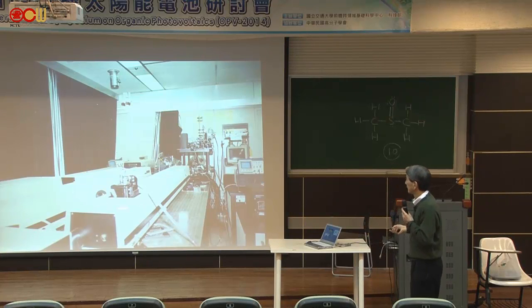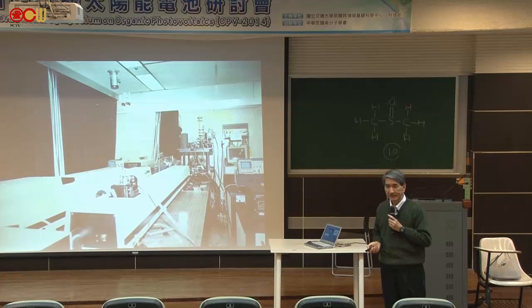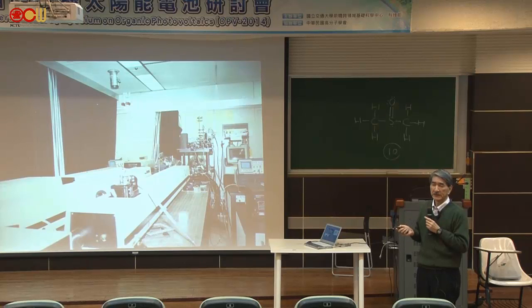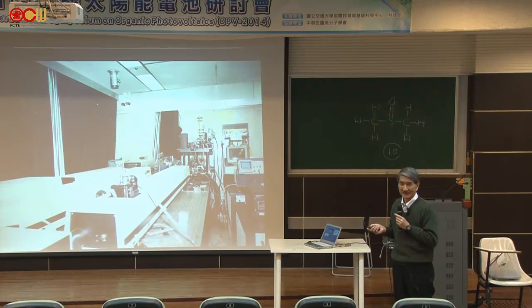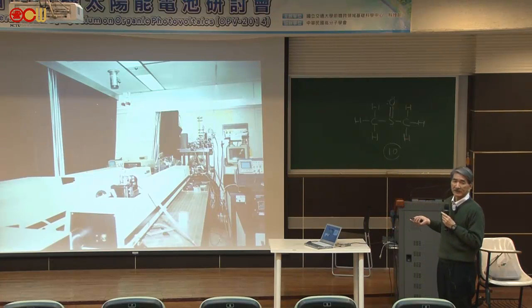All these lasers are very, very expensive, but I was lucky to afford these apparatus, and good people from all over the world, and got a nice laboratory and constructed this system. It's a picosecond time-resolved Raman spectroscopy, and I think this was the world's best system at that time. Unfortunately, now the world's best system is in Britain, because it needs a lot of money to maintain this one.